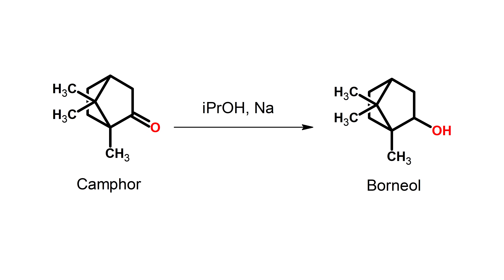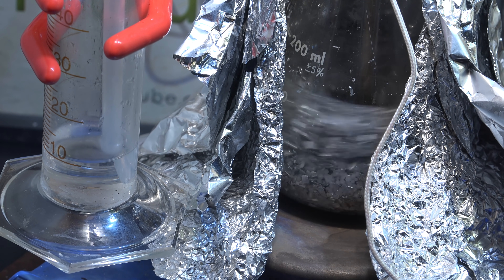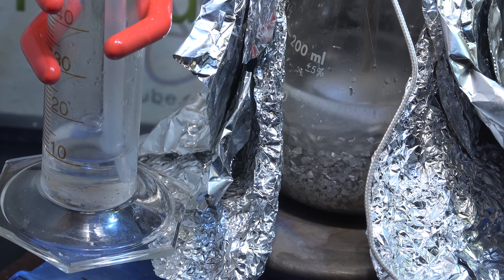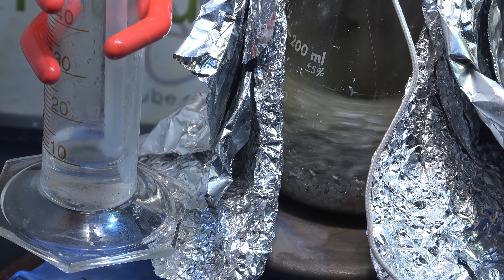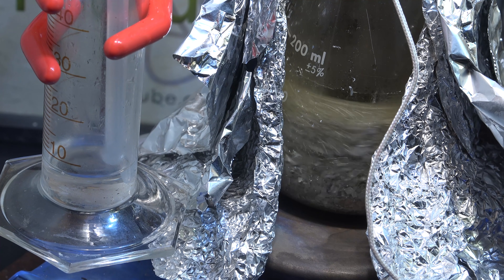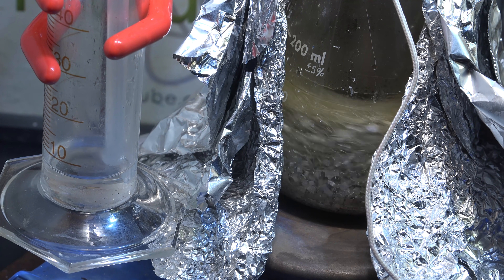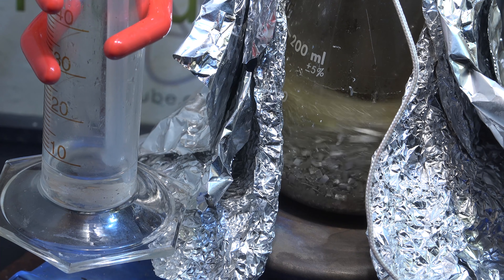Camphor would be a precatalyst rather than a direct catalyst. So I set up a half-scale reaction with camphor as the catalyst and it failed. The magnesium looks the same so it's not being consumed; the color change is likely the camphor undergoing aldol condensation reactions. So it's not creating borneol — it's just getting destroyed.